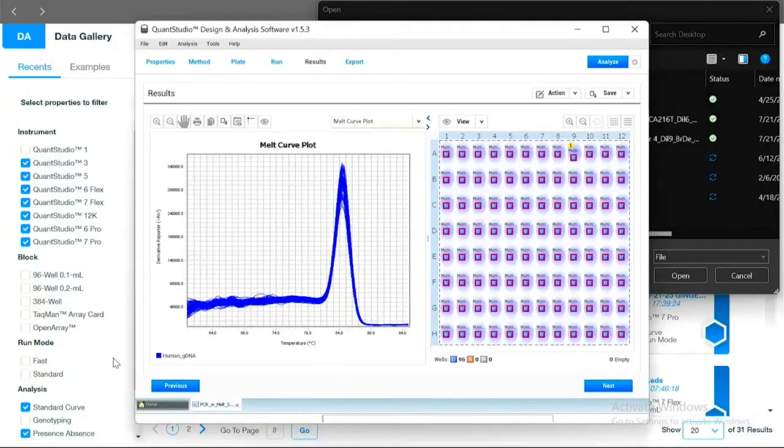Yeah, so you actually have to write across the well. So the way that instrument is set up is we focus the cameras and isolate just the wells. So we only actually capture the fluorescence inside of that defined well area. So as long as you're writing outside of that, you're fine, just not inside. So if you were to take a Sharpie and go across the plate surface, we would see that. And I have an example of that if you want to see it in another presentation.